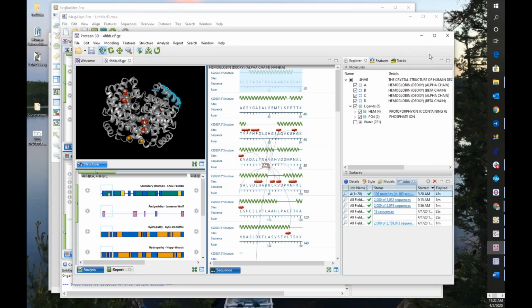So it's definitely helpful. Those are some different workflows that people might not be aware of in our software, where you can easily pull down data from online repositories as well as search various online repositories to bring data in. With that said, I thought we'd now seek into Matt Kaiser's presentation in regards to the ability to use some of our cloud resources.